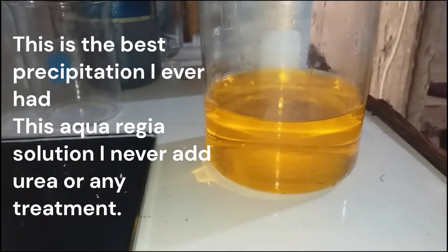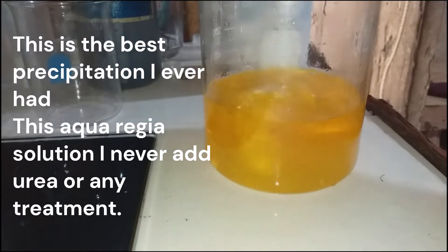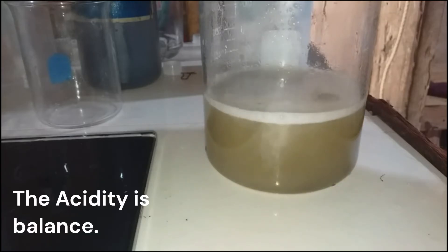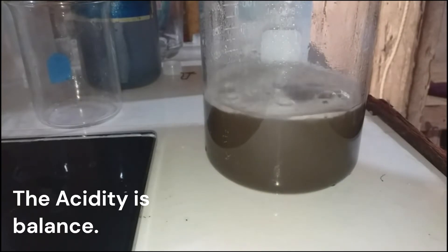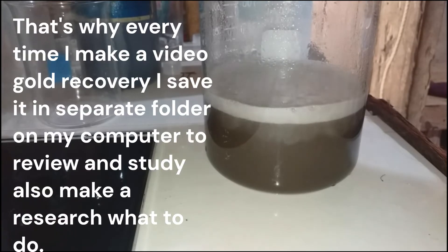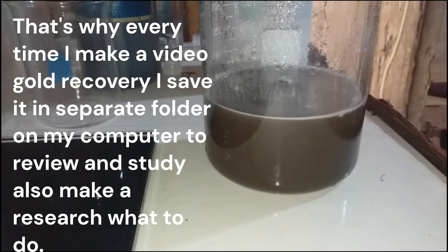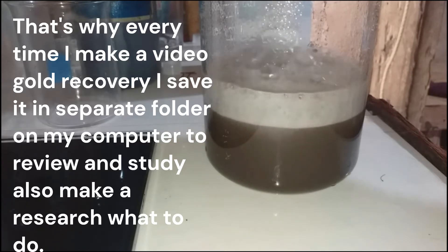Very nice gold solution. Let's take a look as we add sodium metabisulfite right here — it's turning into black, which means we are precipitating gold. In the next addition, the solution creates bubbling at the top of the solution, and I think this is my best precipitation.